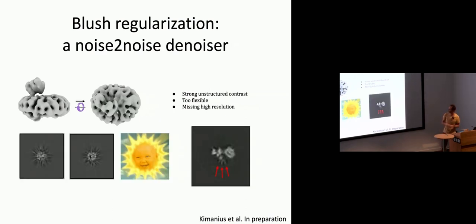The idea is that one problem that you see, if, for example, the particle that you want to reconstruct is very small, then noise can start to accumulate in the reconstruction, even though we do all these Wiener filters, etc. And one thing many of you will have seen is what we call sunshine rays. So you get all these kinds of artifacts into the solvent. This is the mask used for refinements.